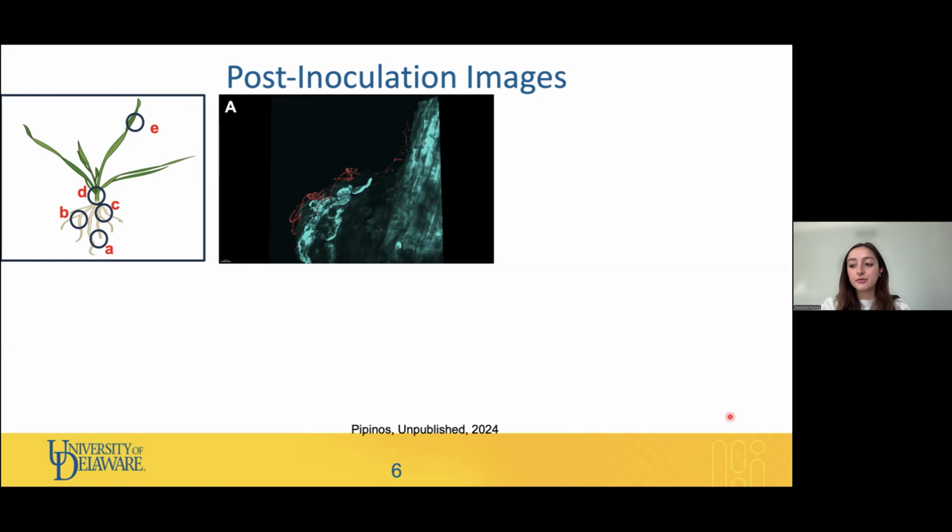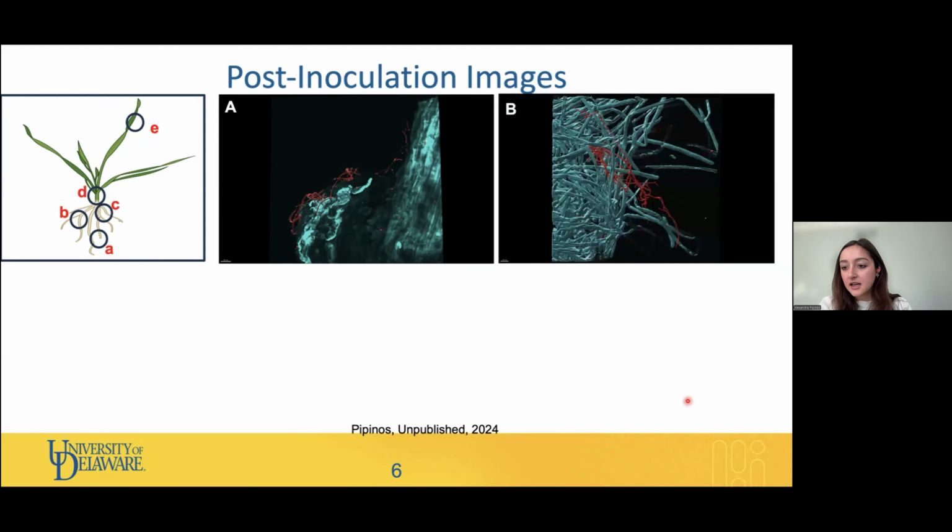I've included representative images that I'll be showing from each region of the plant. Starting with the root tip region in figure A, we see Streptomyces coelicolor wrapping around the entire left side of the root tip, and then moving on to the middle roots.